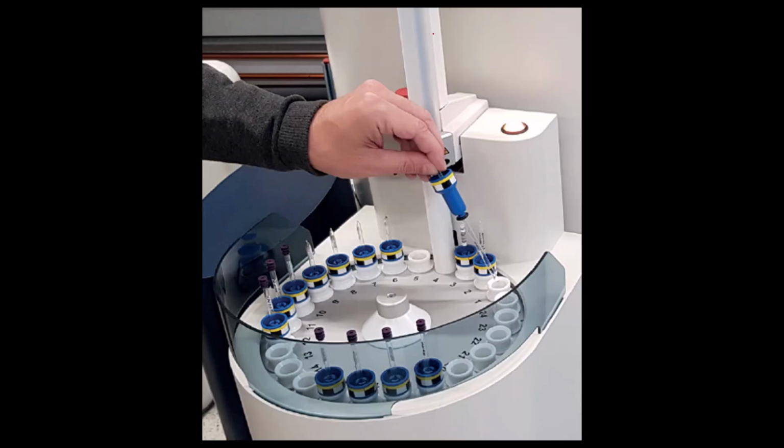So now this is the automated machine. There are two types of NMR machines. One is the automated version, where these are the different sample holders that you can see here. You just have to keep your NMR sample with the spinner into the holders. You can see these numbers. You have to give a command in the computer accordingly, in which sample holder number you have kept your sample, and it will automatically pick up and scan.